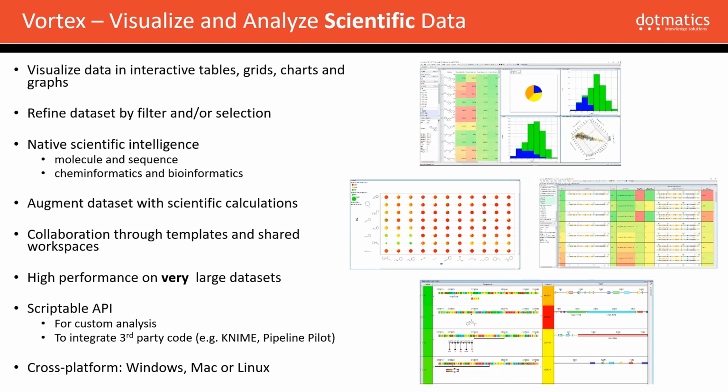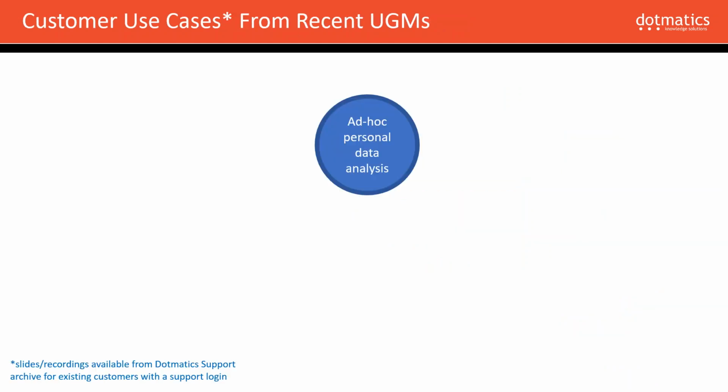We're going to show you on Windows today, simply because we have Windows laptops, but it also works perfectly well for those of you who use Mac or even Linux workstations. So that's a very brief overview of what Vortex is.